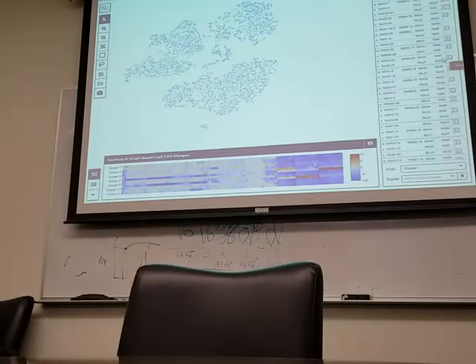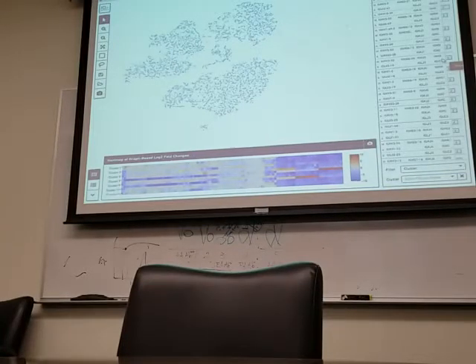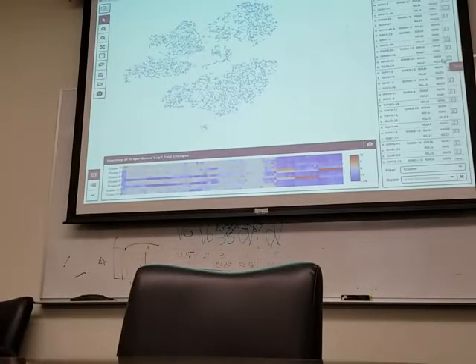I don't think anybody, I mean, that's binary. They just assign a V gene to it. Right, it's this one or that one. But if you don't get clonal expansion, if you relax D to a point where, here's the thing. I think it's V, D, J, and then from there they expand and mutate.